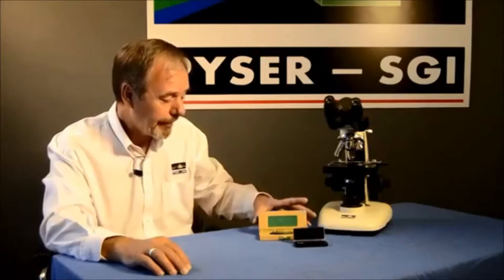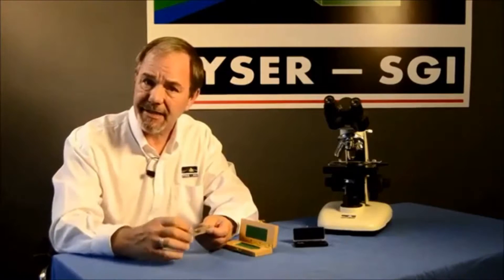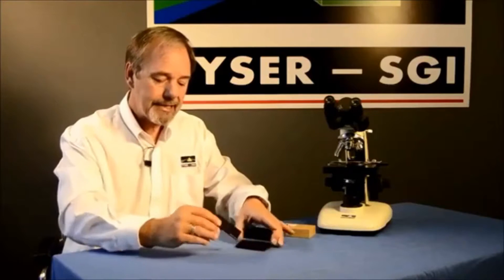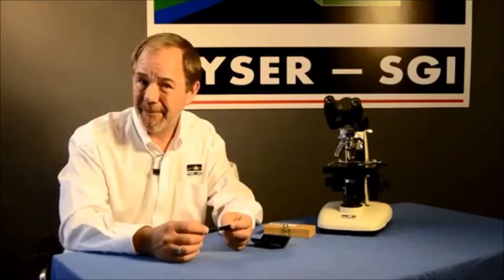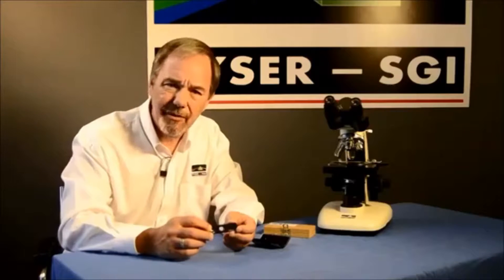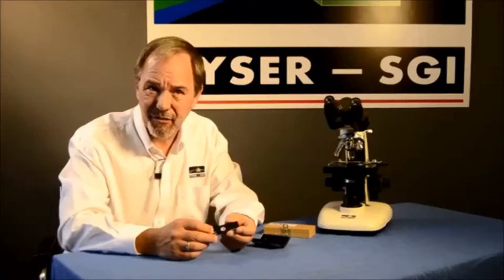I have some examples here. In this professional stage micrometer we have the pattern on a glass disc which is mounted in the centre of a stainless steel carrier. This stainless steel carrier has an embossed serial number which is unique and it comes in a smart wooden box — an ideal item for certification as an internationally traceable calibration artifact. In this other case, the same pattern is held on a glass disc in the centre of a black aluminium carrier. This glass disc and metal construction lends the stage micrometer durability that an all-glass construction may otherwise lack, an all-glass slide being more prone to being accidentally dropped or damaged.